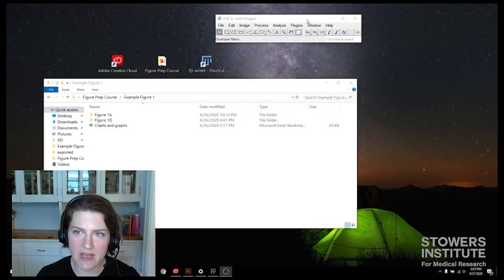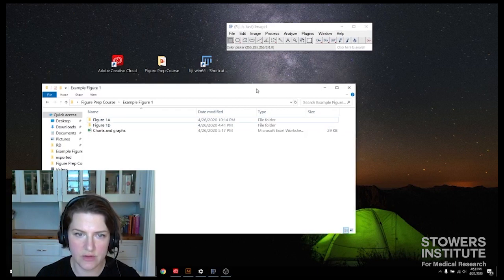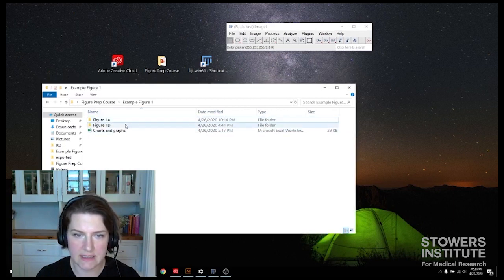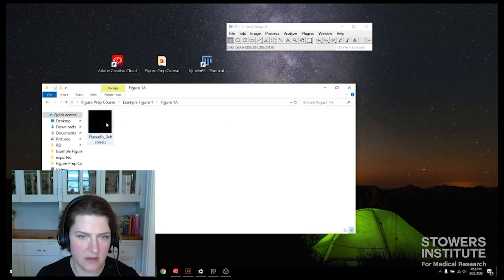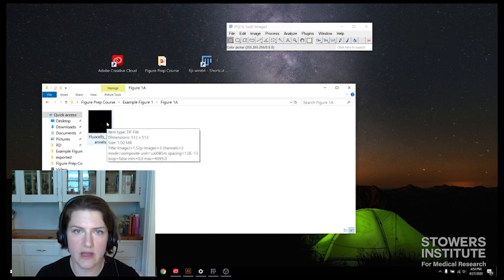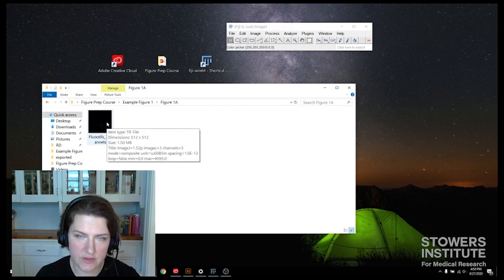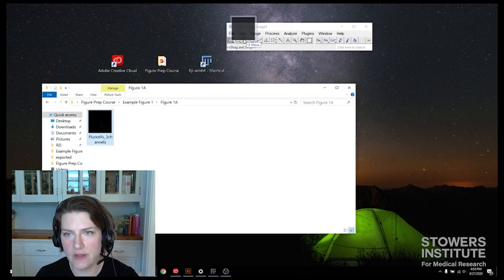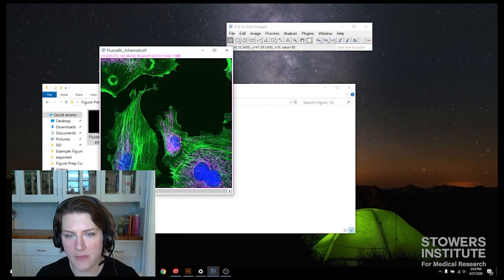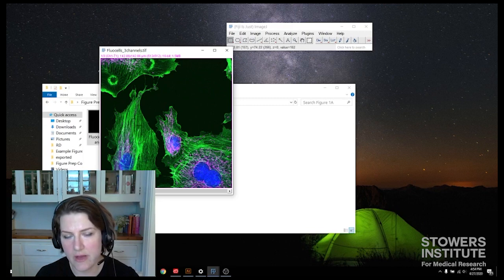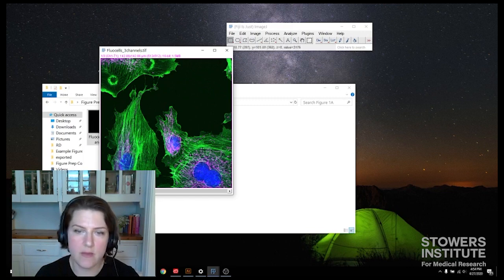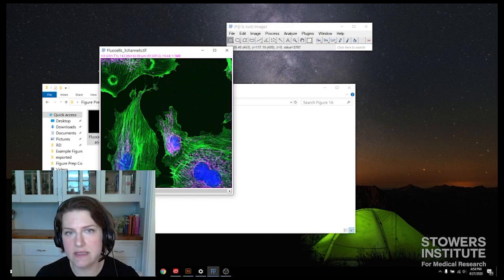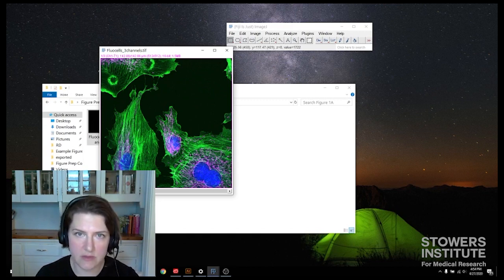So I already have Fiji open here, and I also have my folder open with my data in it. My figure 1a is just going to be one image figure. We're going to have individual channels and then the merge. So I'm going to open that. Here's my three-channel image. So I want to do grayscale images of my green and magenta channels, and then we're going to have a merge that also includes the DAPI. I've used magenta instead of red because that is more accessible to people with colorblindness, so keep that in mind when you're setting yours up.